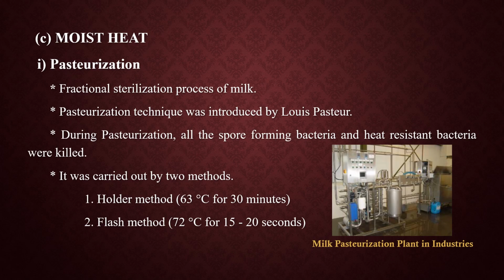And the third one is moist heat. It has four methods: pasteurization, boiling, tyndallization, and autoclaving. The first one is pasteurization. Pasteurization is the fractional sterilization process of milk. Pasteurization technique was first introduced by Louis Pasteur. During pasteurization, all the spore-forming bacteria and heat-resistant bacteria are killed.